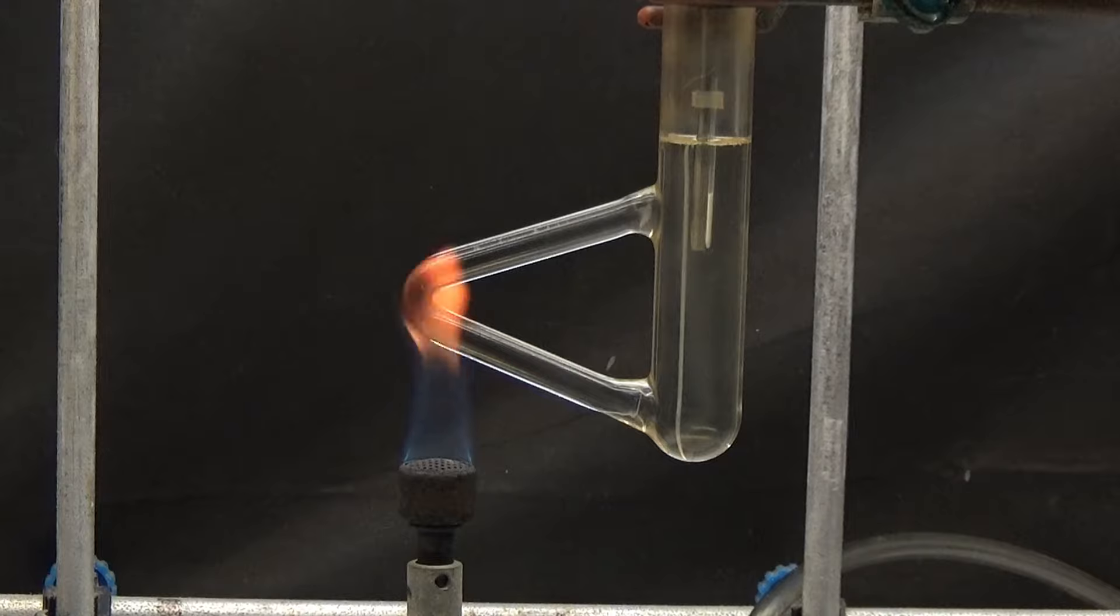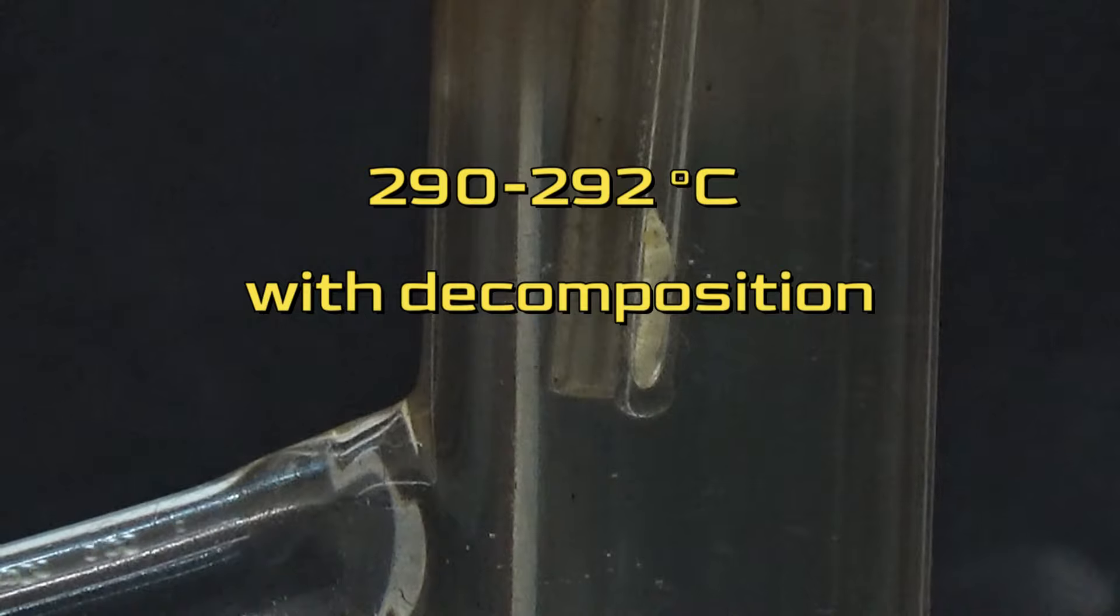After it's dry, we determine the melting point. According to the literature, aminophenylacetic acid melts at 290 to 292 degrees with decomposition.